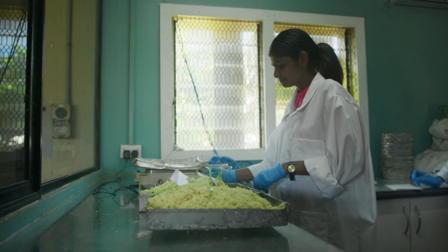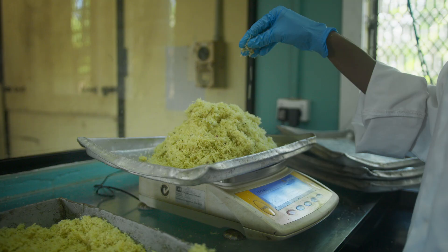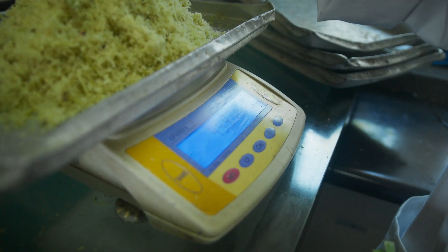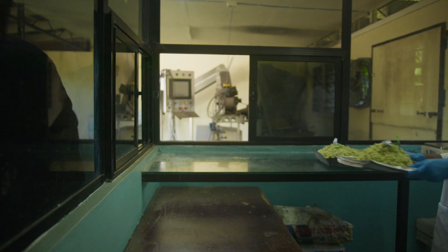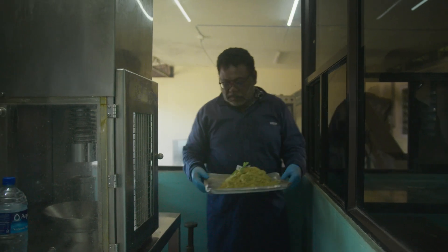After grinding, we then have to weigh a certain amount of it. That weighed amount is then extracted for juice.